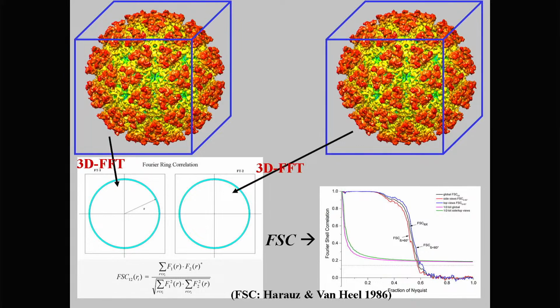What does that mean? That means that the correlations, because you have so many members, are pretty defined. The random noise component is very low. And therefore, you have a threshold curve, which is called the half-bit threshold curve, which drops off here and becomes, when you are close to the Nyquist frequency, pretty flat.